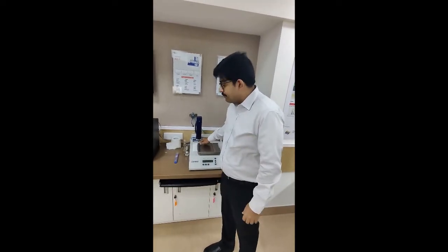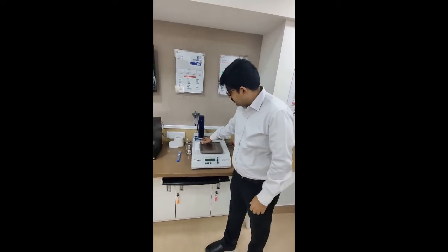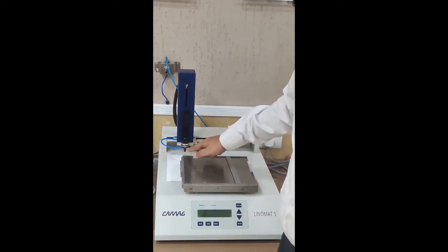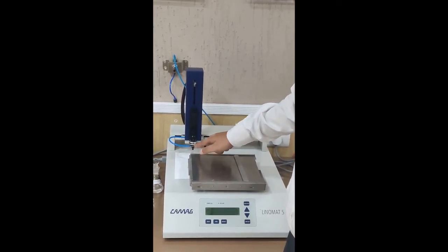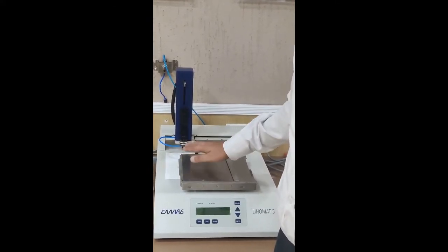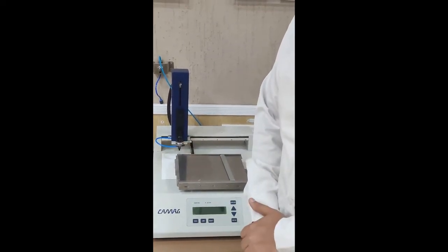The second tip is to observe that there is a calibrated length between the Linomat 5 nozzle and the plate. If you are facing spilling even after using the right application speed, please contact the service department, who will calibrate the distance from the nozzle to the base of the plate, which will give you very sharp bands for your analysis.